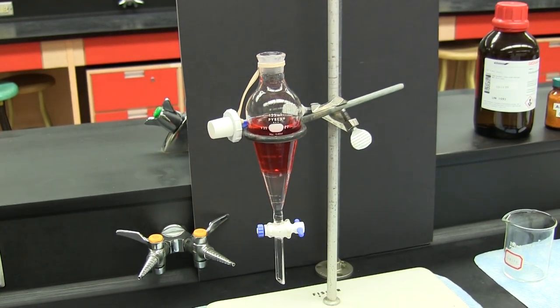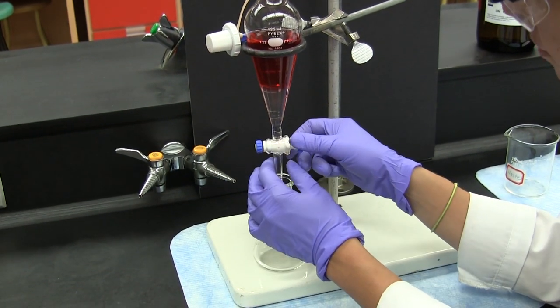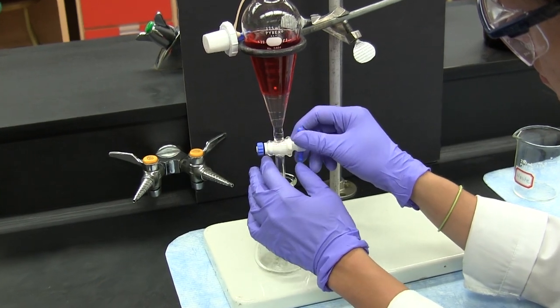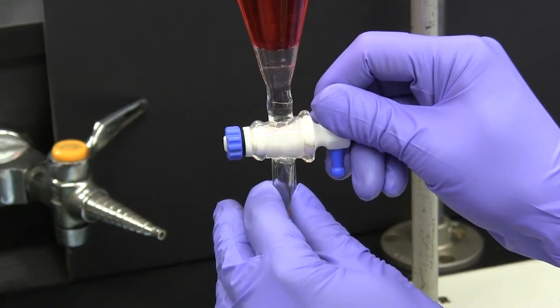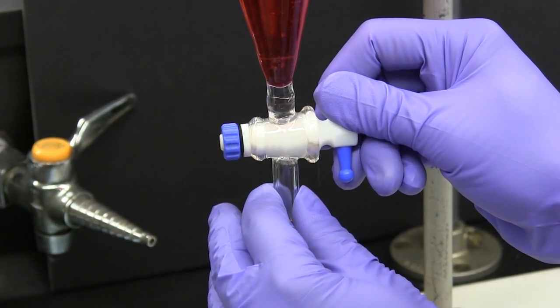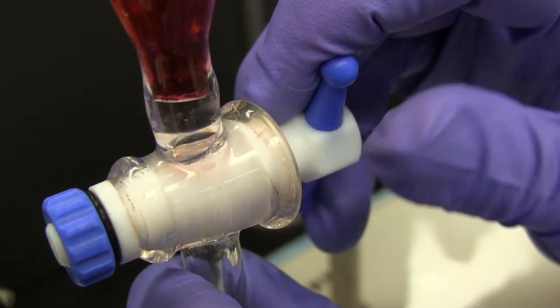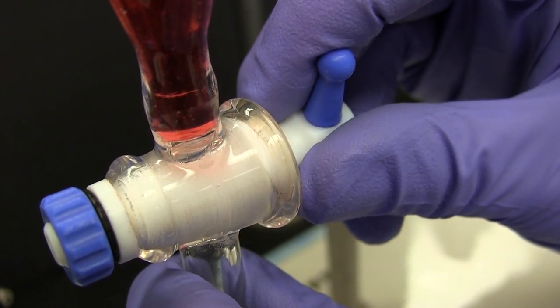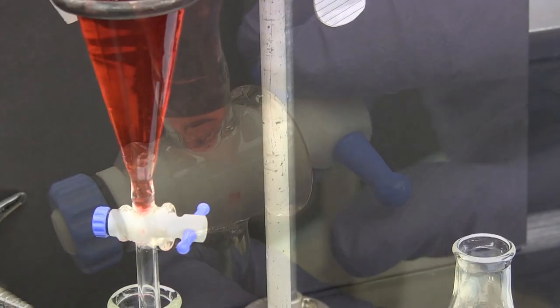A suitable container is placed underneath and the stopcock is opened, allowing us to collect the bottom dichloromethane layer. Watch carefully as the interface between the two layers moves towards the stopcock so that you are able to stop the flow once the entire lower layer has been removed. Partially close the stopcock to restrict the flow and watch carefully. You will achieve a good separation if you close the stopcock just as the interface flows into the top part of the stopcock.